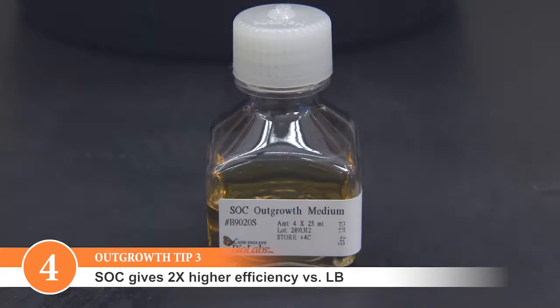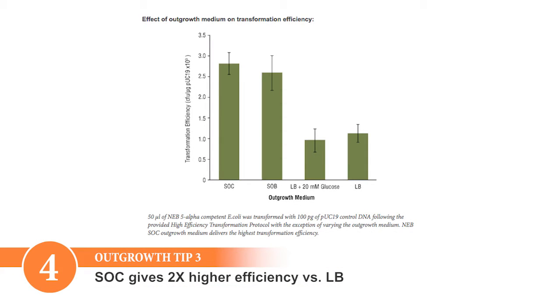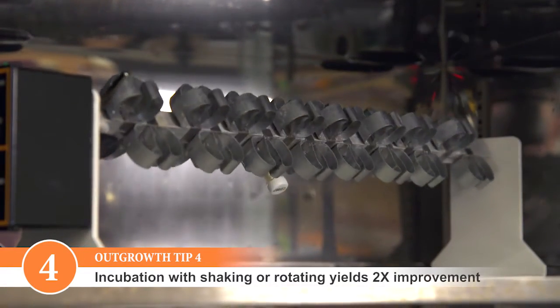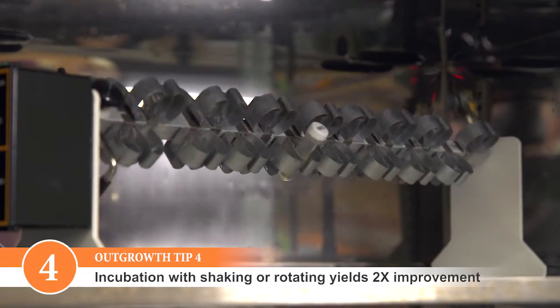SoC gives two-fold higher transformation efficiency than LB medium. Incubation with shaking or rotating the tube gives two-fold higher transformation efficiency.